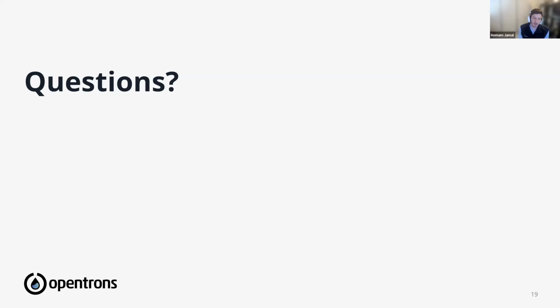Absolutely. The difference between us and them is that we're trying to get as close to accuracy as possible. So the data that we're going to train on is going to have liquid class data from our scientists and field application scientists, but in the grand scope of things, yes, we are both trying to use AI to generate protocols on a Python-based liquid handling system. I think Synthase does it for a lot of other ones as well, and they're trying to apply it with their software, so it's more broad.